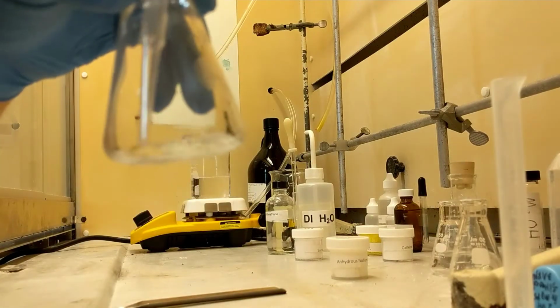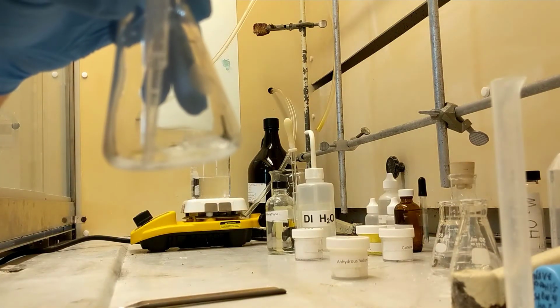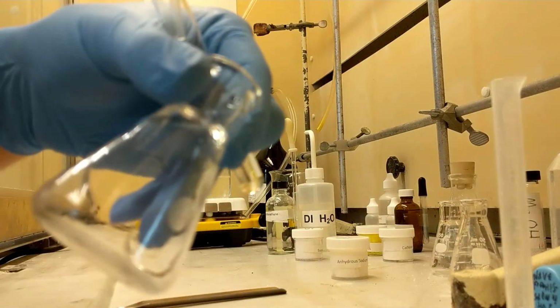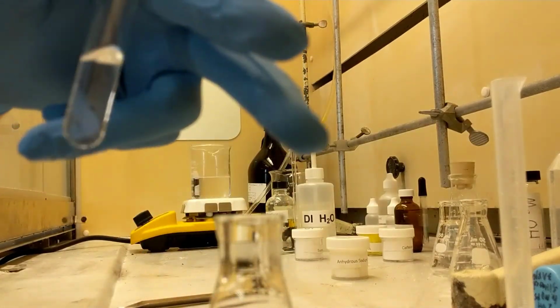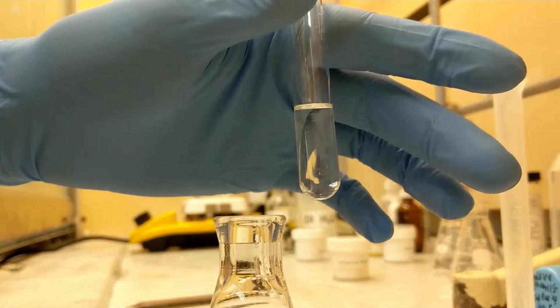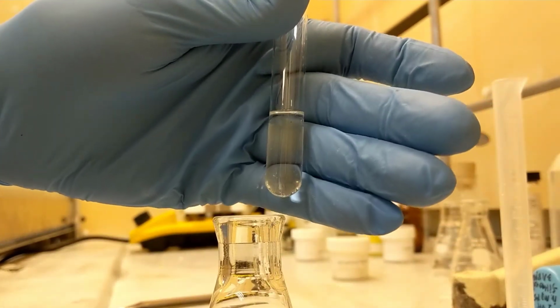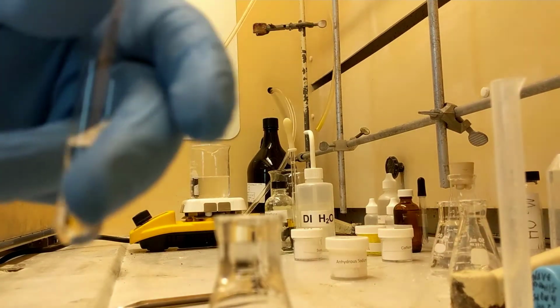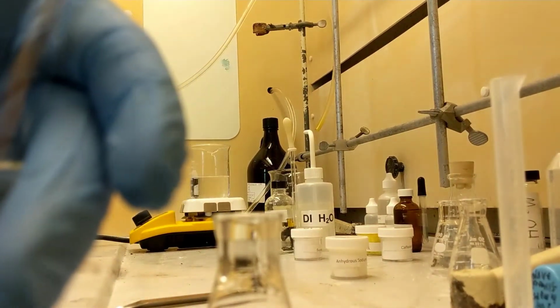I think I got just a little bit left in there. I'm just going to soak it up. Transfer it in there. Boom. Test tube of methylene chloride, clean and dry, no water. Alright. I'll be back in a second.